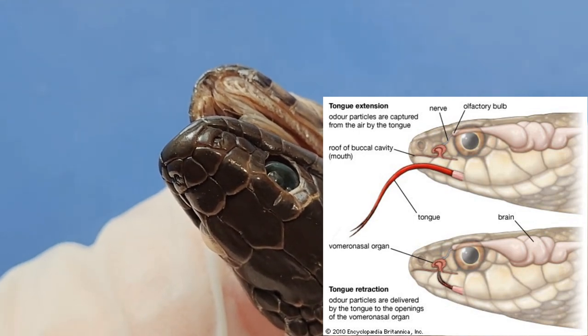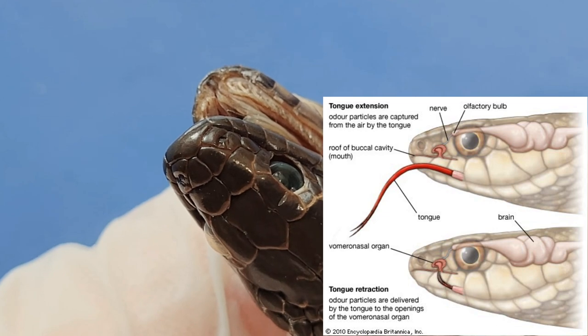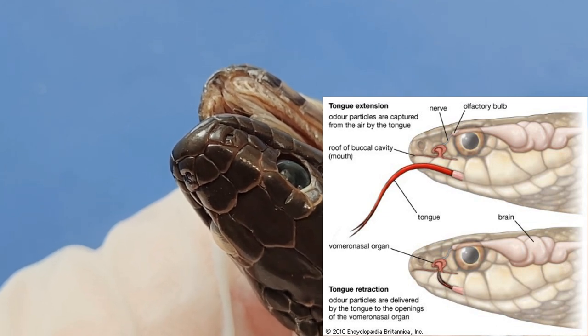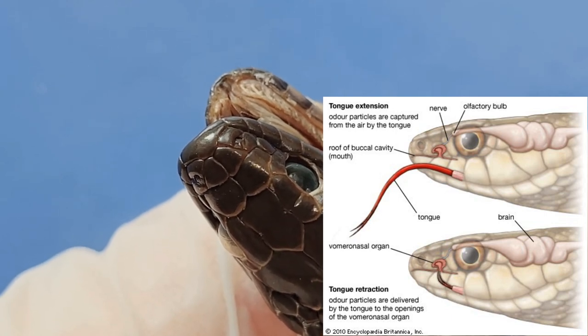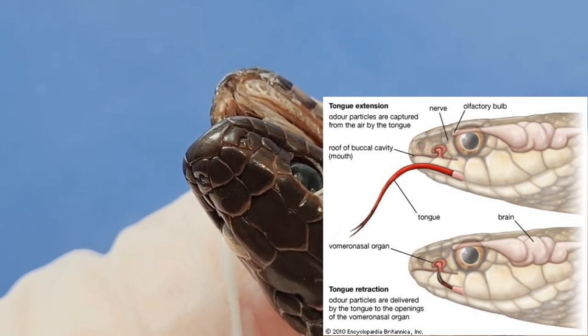How does that work? Snakes flick their tongue out into the air, collecting particles. Then the snake brings the tongue back into its mouth, where specialized cells detect the smell of the particles.